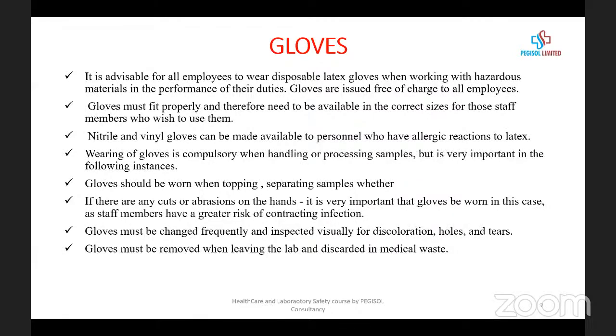There are basically three sizes of gloves: small, medium, and large. Pick the one that fits you so that you can work effectively. Nitrile and vinyl gloves can be made available to personnel who have an allergic reaction to latex.